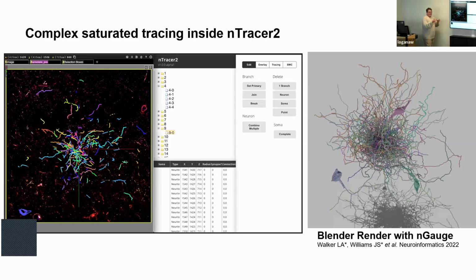So it creates this sort of spaghetti ball of neuron interactions that we then rendered in 3D with some bioinformatics tools that our lab developed for this purpose. So it creates this nice 3D model. But this is what it looks like if you just take a blade and slice through the middle. You can see all of the nightmare of spaghetti that comes in through the center there.